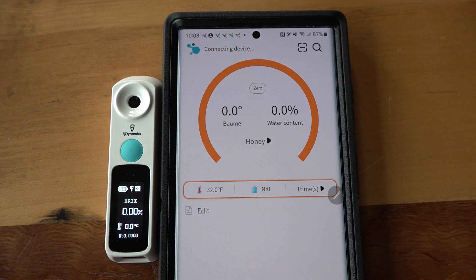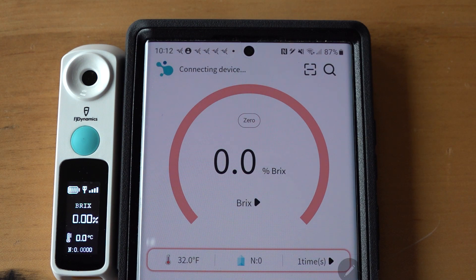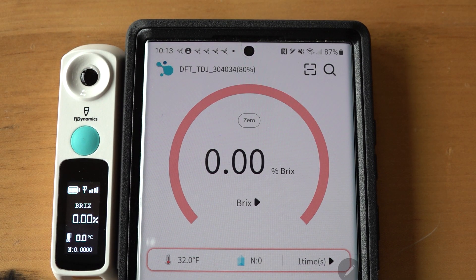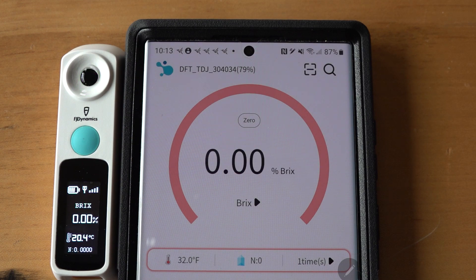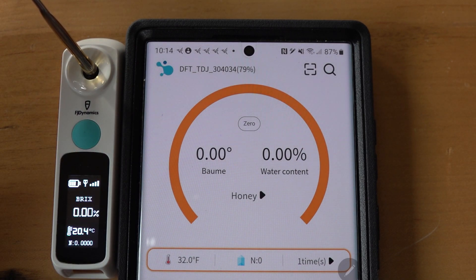When it gets stuck and won't connect, you have to turn it off, confirm you're not connected, get out of the app entirely, and restart. I make sure the FJ Dynamics refractometer is on, click the app again, and eventually it reconnects. But now it shows 'Brix' on my phone — so I have to click that, go back to the website section, zero it out again, and select 'honey.' Notice it still doesn't say 'honey' on the actual pocket refractometer itself — that's a bit annoying.